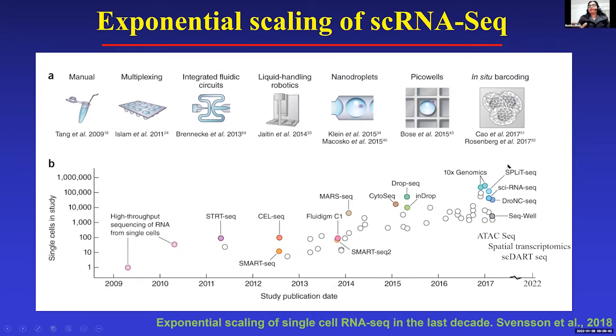So 10x Genomics is also taking care of higher throughput, in terms of cells and in terms of reads, and it also gives us new techniques, not only to do single cell RNA-seq analysis, but also DNA-seq analysis. And there are also latest techniques like ATAC-seq, which helps in measuring the chromatin accessibility of the cells.